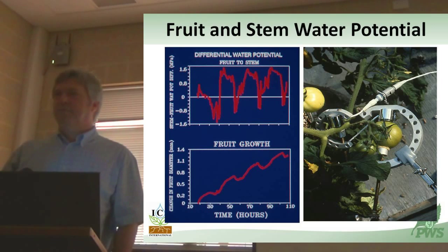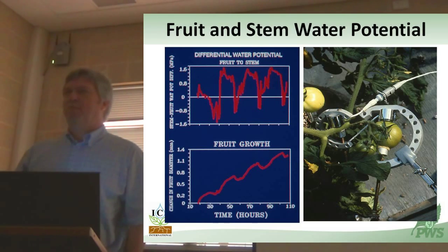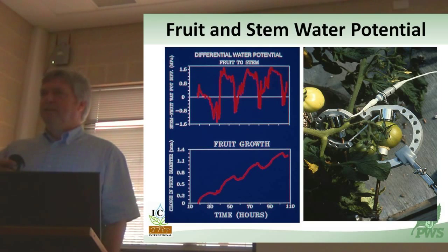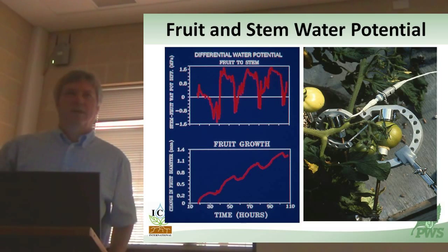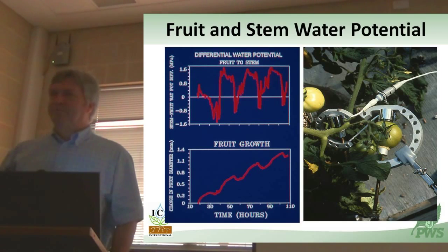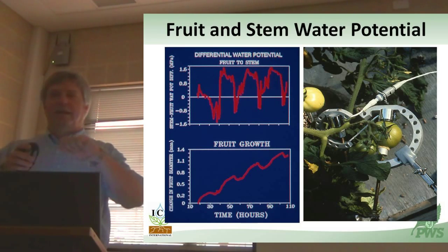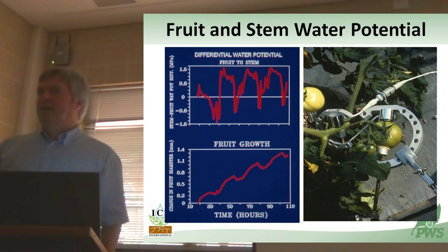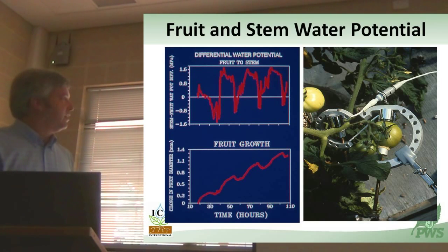I'm looking at the differential water status between the stem and the fruit. Fruits by their nature don't like to have holes in them, so they callous over very quickly. The longevity of this installation is probably less than a week - two or three days is really reliable. You can tell when it starts to lie to you because it all drifts to zero. The stem installation is a little longer-lived because it doesn't react with callous tissue as quickly, especially if you prepare it properly and get below the cuticle into the densest region of water-conducting tissue.